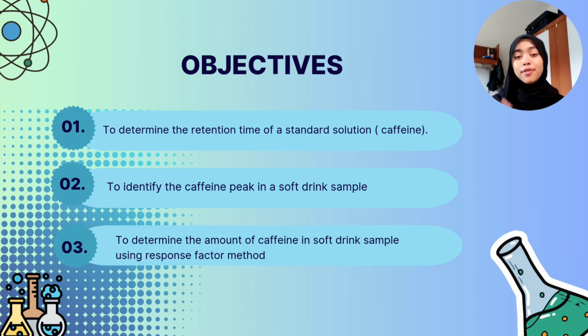So, next we move to the objectives of this study. This study has three main objectives. First, to determine the retention time of the standard solution, caffeine. Secondly, to identify the caffeine peak in the soft drink sample. The last one, to determine the amount of caffeine in the soft drink sample using the response factor method.